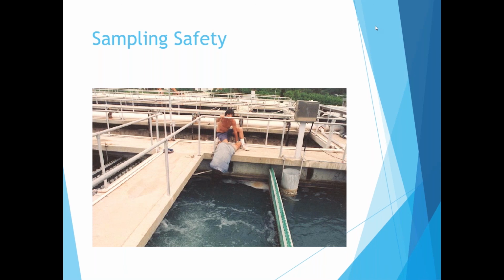And in northern climates where you have snow, if your sampler is outside, you might need to insulate it to keep it from freezing. So that's another challenge that you'll come across. And I've seen people just take attic insulation that you get from Home Depot, put it inside a garbage can, and use that as a cover for their sampler.